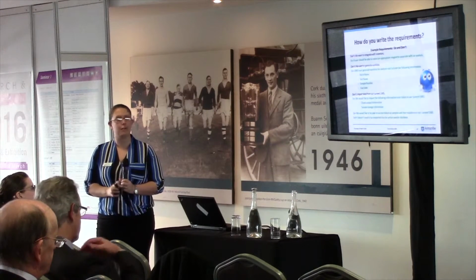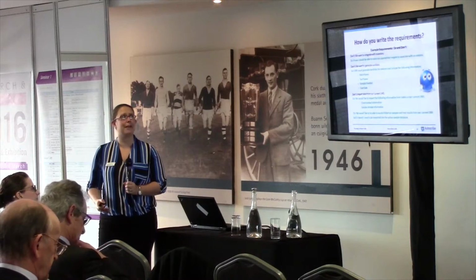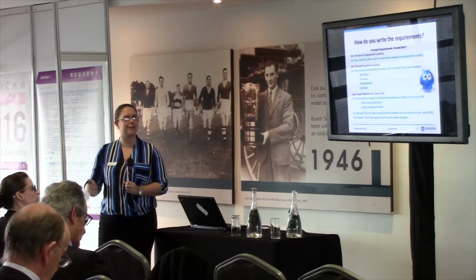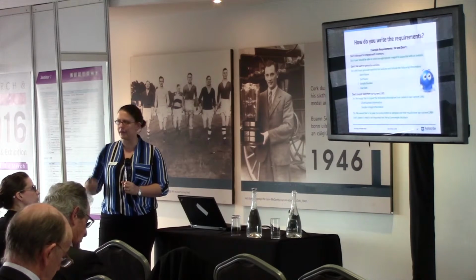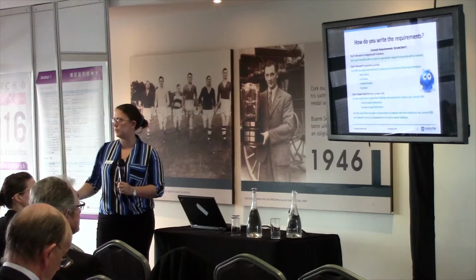We want to generate work lists. Actually, what we really want to hear is what's the batch name, test name, sample number, due date. Just that little bit more information will mean that we can provide a much better spec for your system.